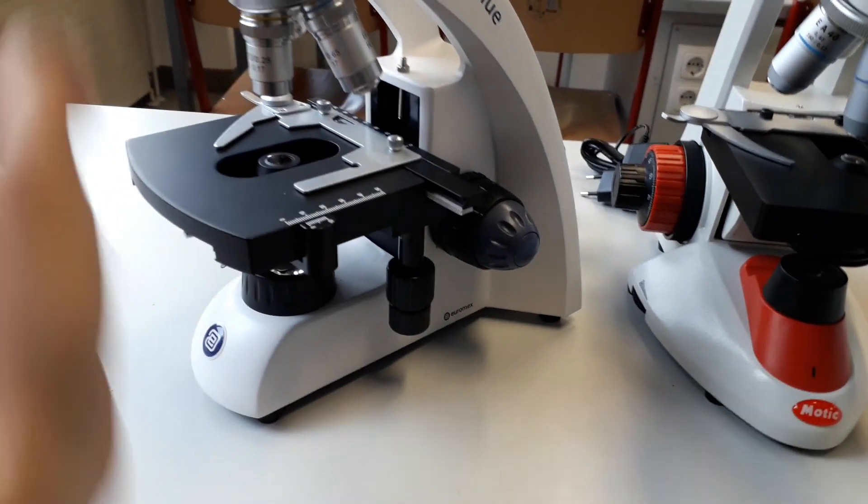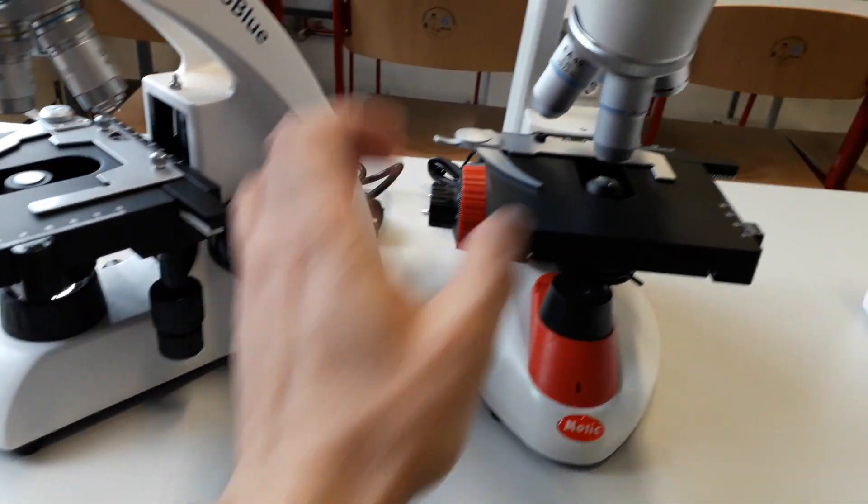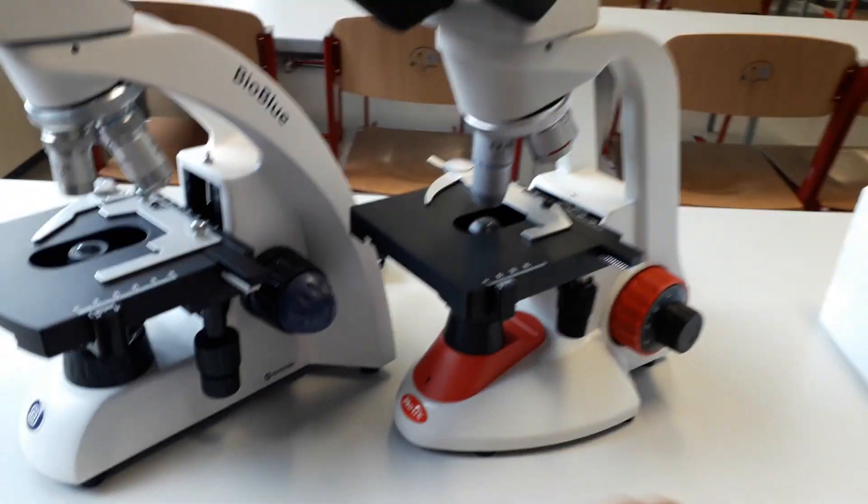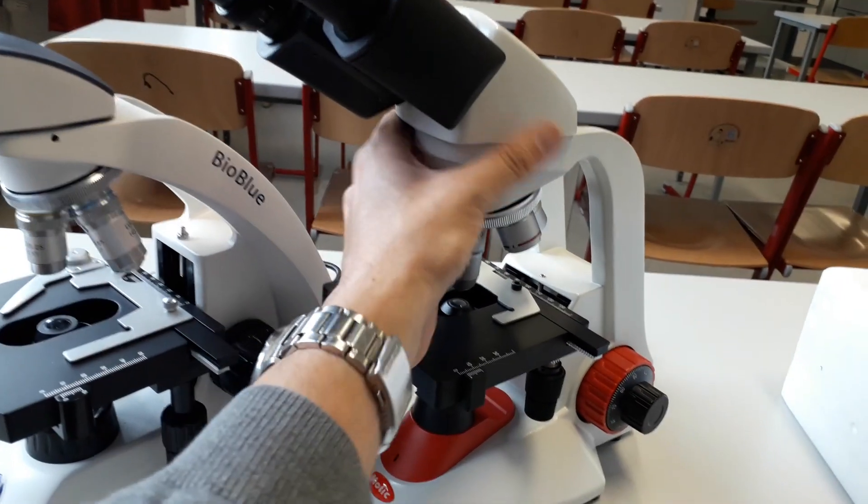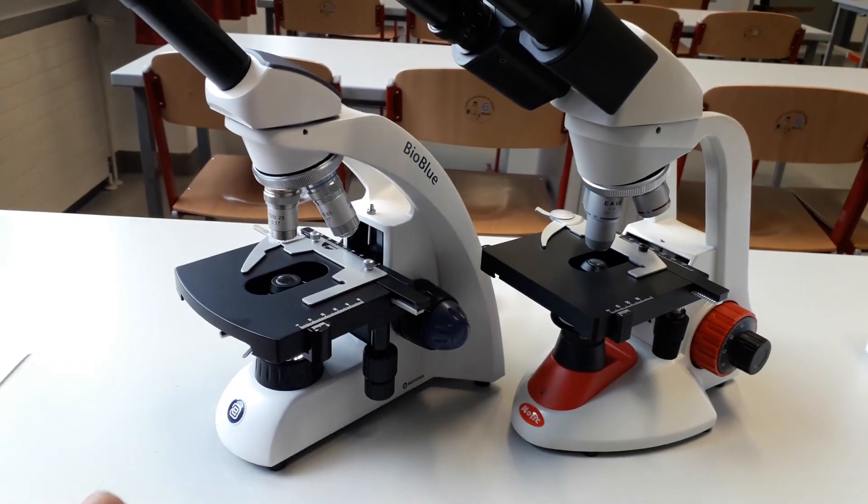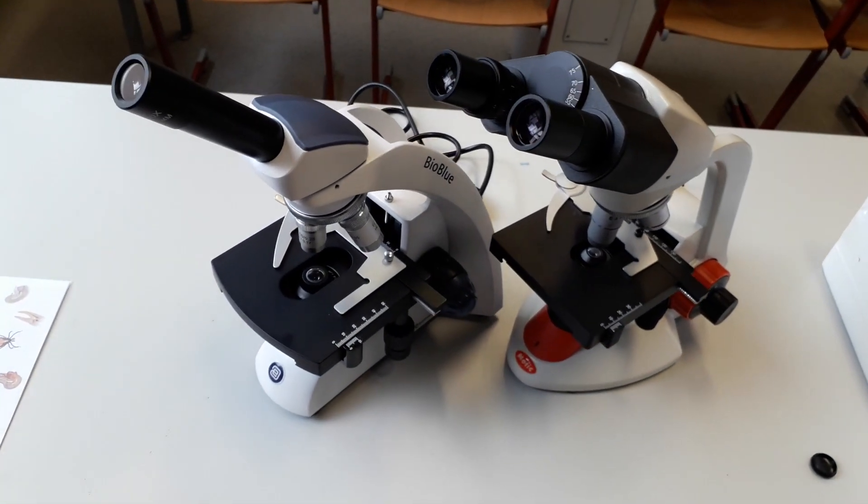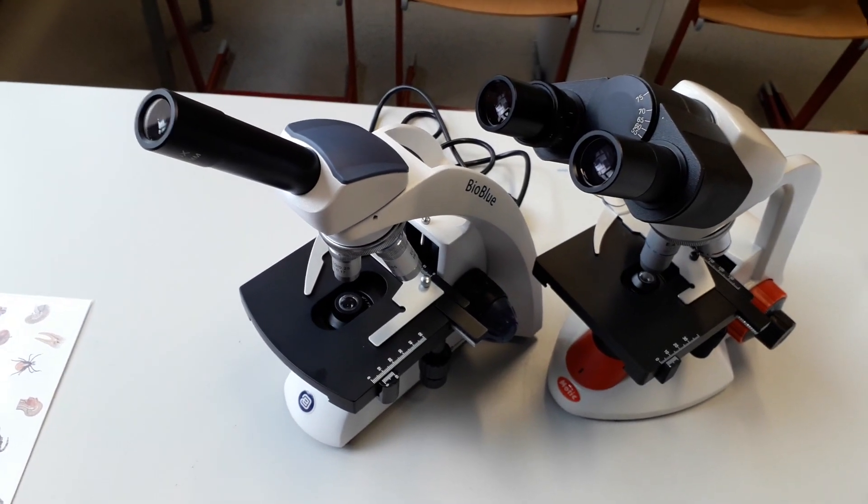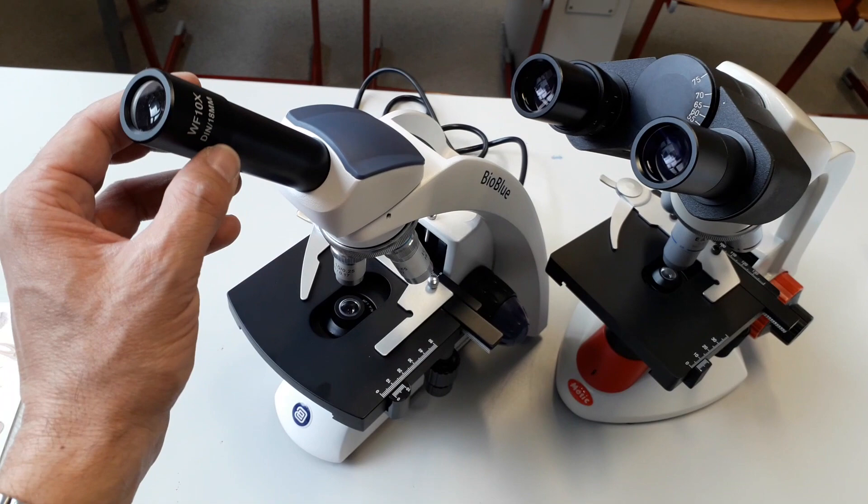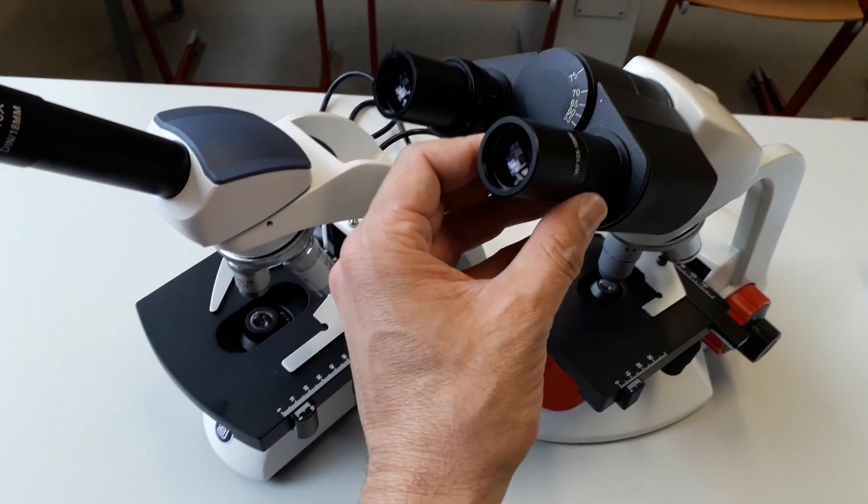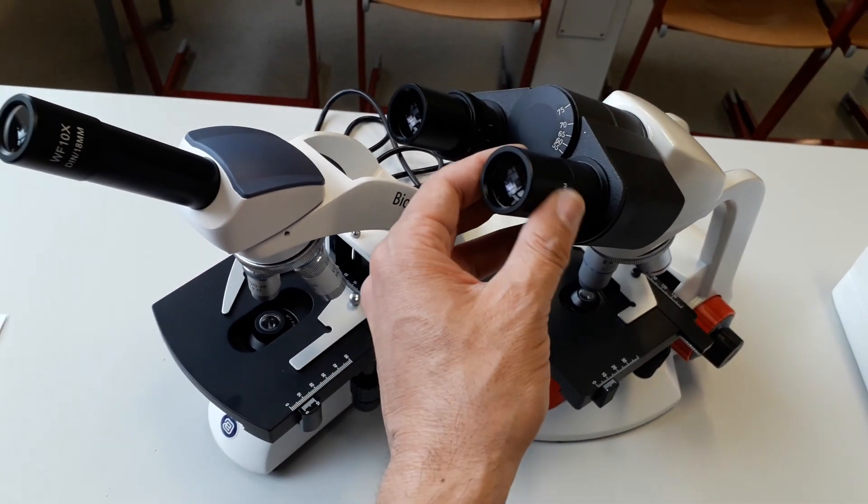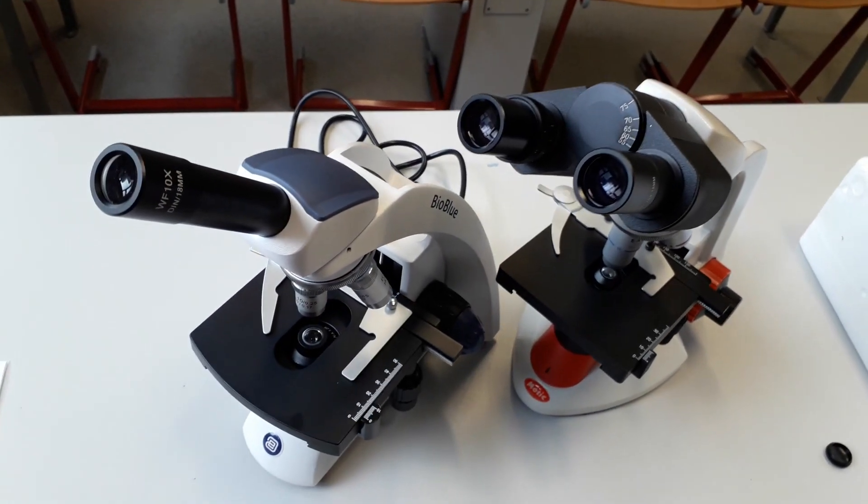Here mechanical stage. Both of them have a mechanical stage. Looks pretty much the same. This one is going to get a monocular head. I don't know. Honestly, both are equal. At least from what I can see from the outside now. What about the eyepieces? What do they have here? It's a 10 times. 10 times 18. So the 18 refers to the field of view. Even they are the same.